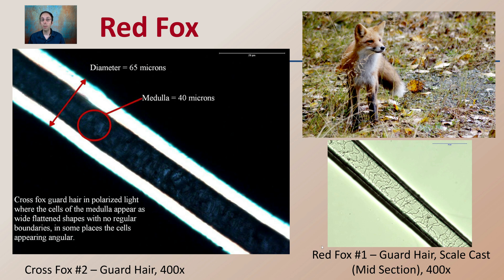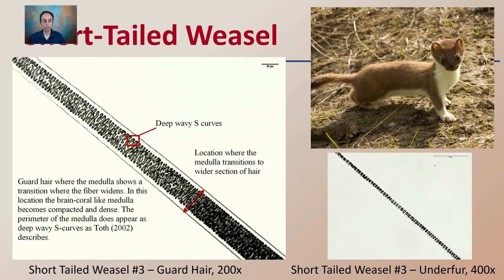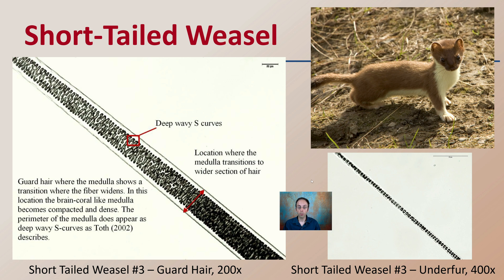This is the midsection of the guard hair. Keep in mind where you're taking the sample — the lower section, the mid, or more towards the tip region — can impact what you see in an image, so it's important to document that when taking pictures. For the short-tailed weasel, the guard hair shows a transition where fibers widen, with a deep wavy S-curves in the medulla. The location where the medulla transitions has a wider section of hair. This is at 200x magnification. The underfur region also shows a very different medulla.